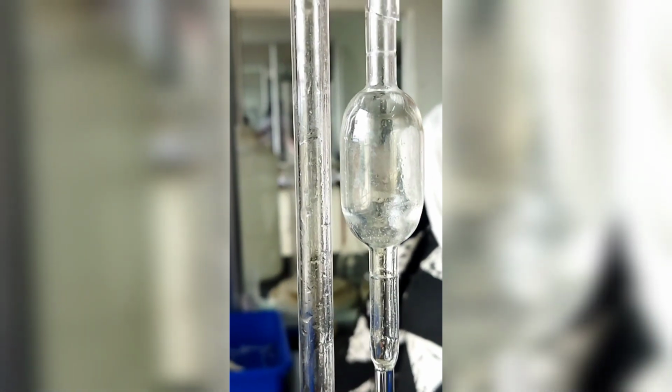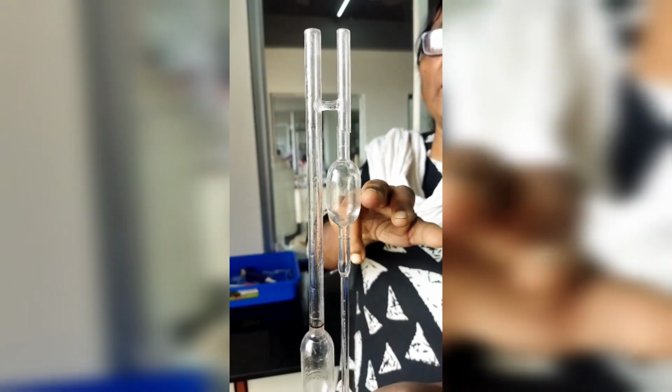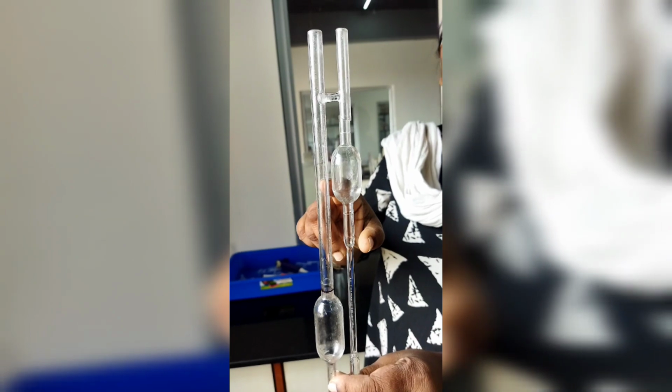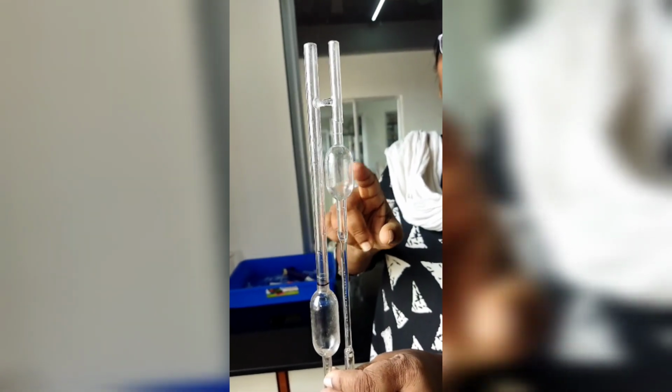Now, 2 things we have to be very careful about. One, if the level becomes equal, suppose the liquid has come up to this level and here this level is there. It has reached this level. Because as it flows down, the level goes up here. So the whole flow will be stopped. So right from the beginning, we have to maintain a difference of the level.